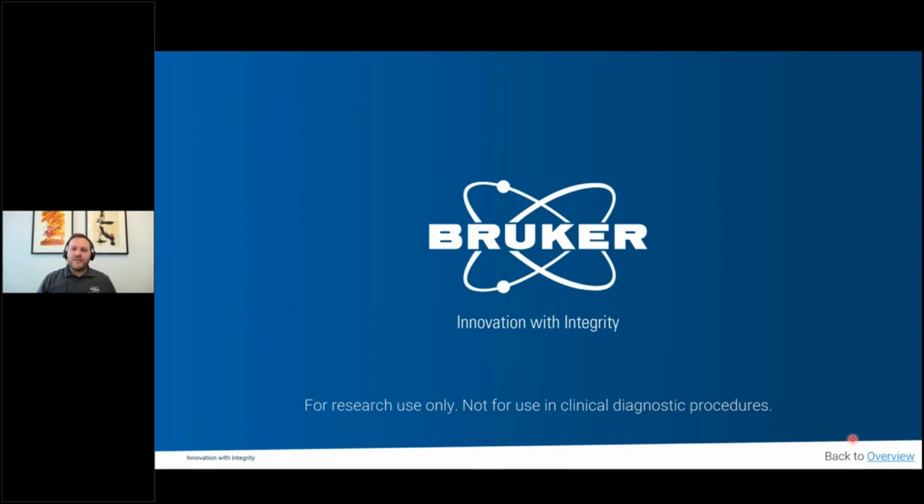And with that, I'm going to end the presentation slideshow part of the webinar, and we're actually going to move over into MetaboScape to show you how some of the things that we've done in our PowerPoint here are done in real time and how easy it is to perform within the software.